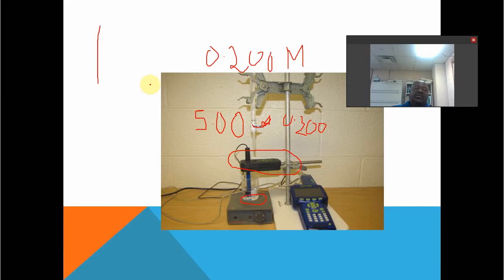So our expectation is that if I write pH versus milliliters, and 5 occurs here, then I expect around 5 to get the steep region and flattening thereafter.